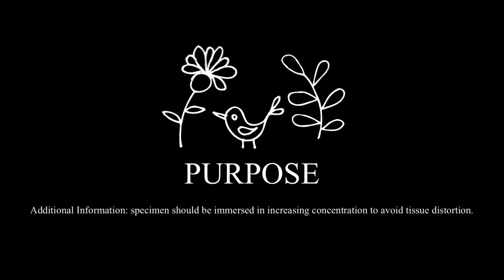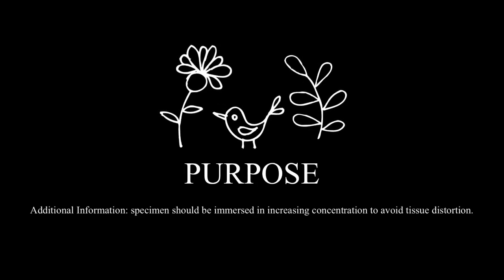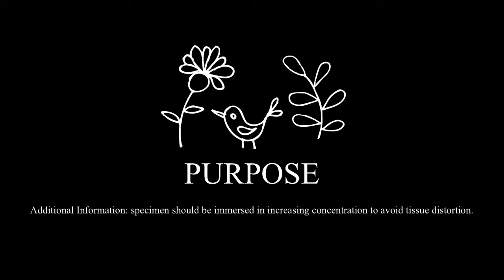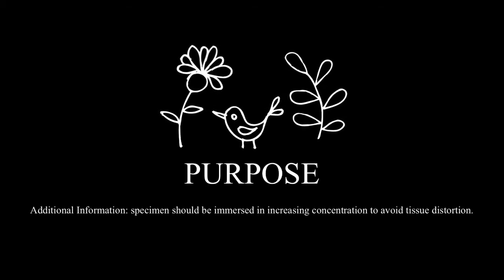But why do we need to fully dehydrate the tissue, you ask? As a medtech, it is very important that you should know why you are doing dehydration and the mechanisms behind it. Well, from the word dehydration itself, it simply means to remove the water from the tissue specimen.